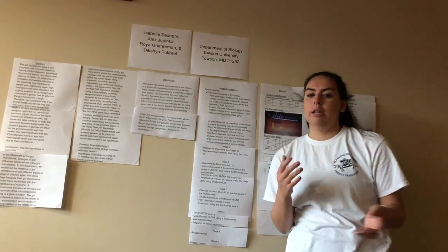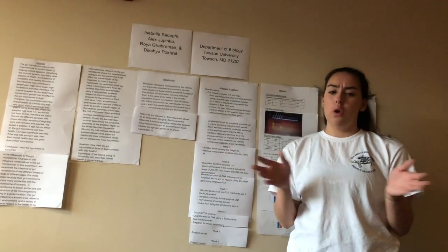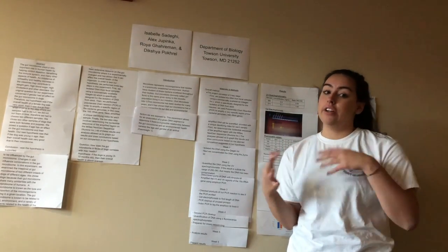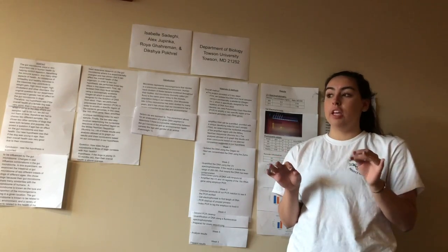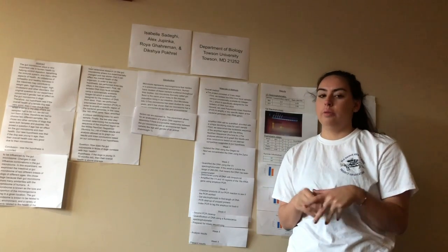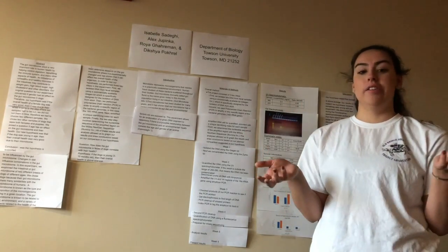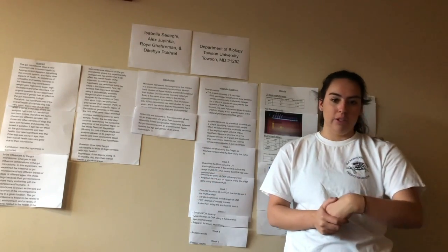So talking about our quantification results of the indexing PCR, the results were very low concentrations of DNA from all of our samples. As I said, there was DNA in our negative control, and our positive control had some, not as high as our negative, but it did have some results from the E. coli. However, we did expect that our negative would have 0. But like I said, it turned out having DNA, and that indicated cross-contamination from our samples.